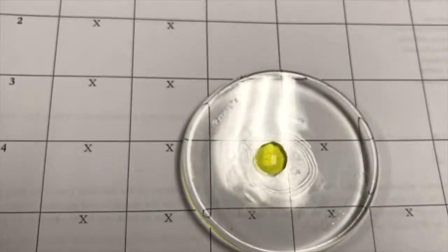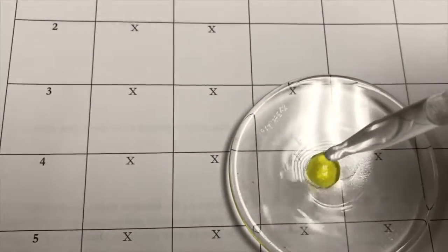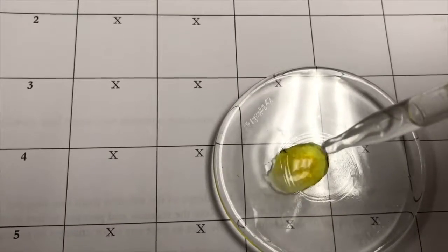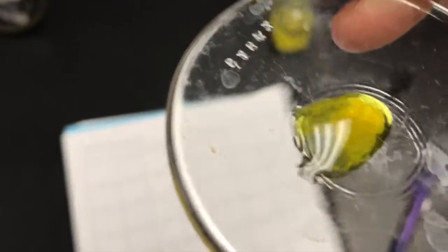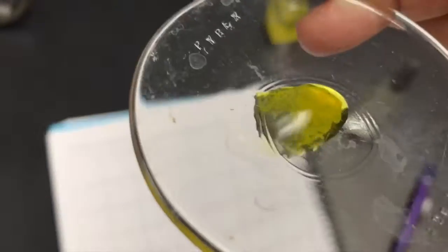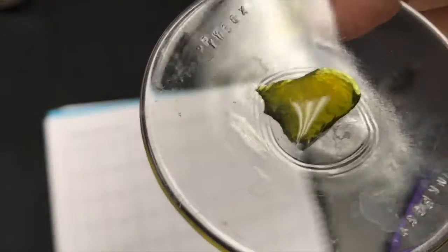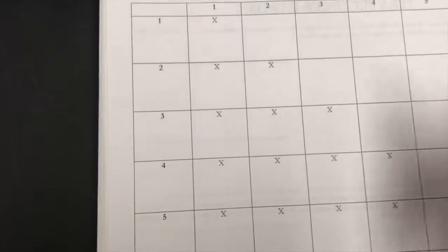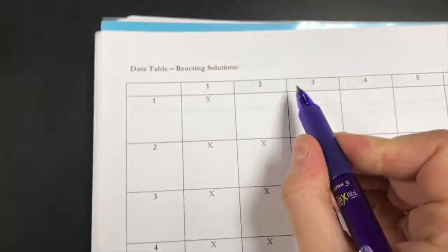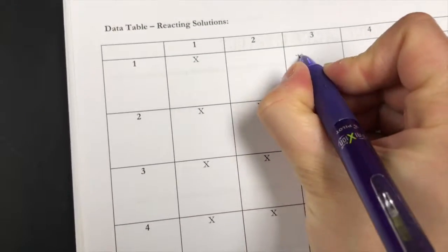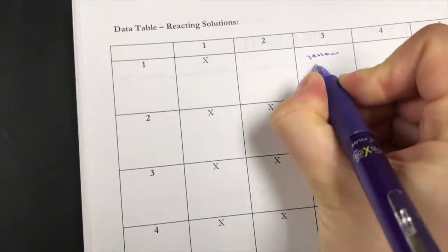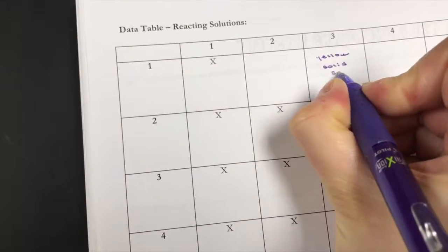Make sure that you look at this really carefully. If you look at this, notice a yellow solid formed, and so what I'm going to do in my notes is write for one and three: yellow solid forms, and I'm going to be able to use this information later on when I'm trying to figure out the identity of each of these substances.